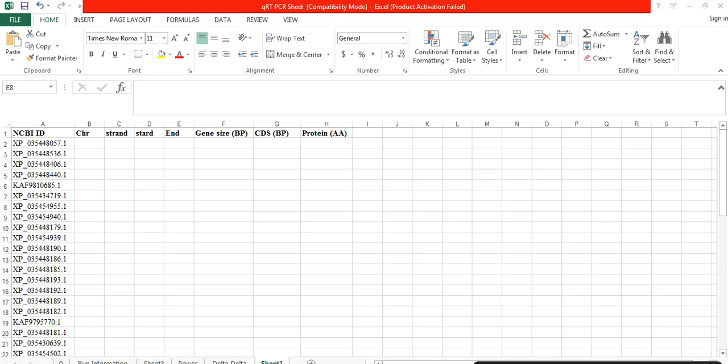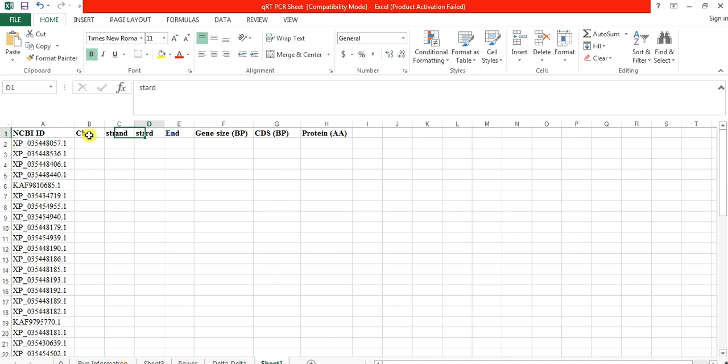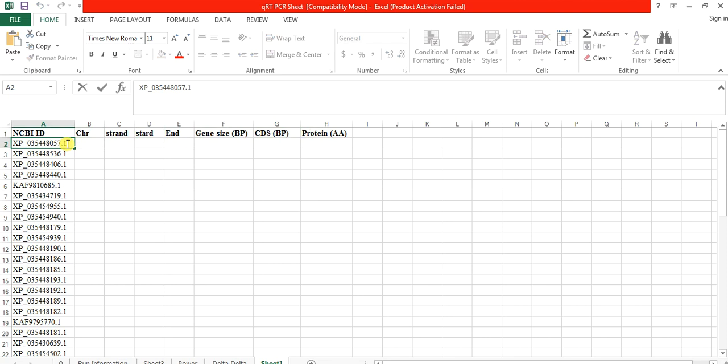So in this video we will try to get this information from NCBI. Let's start. For example, you have these genes and these are the NCBI IDs, and you want to know information like chromosome, strand, start and end position, gene size in terms of base pairs, CDS sequence in terms of base pairs, and amino acids protein that these genes contain.